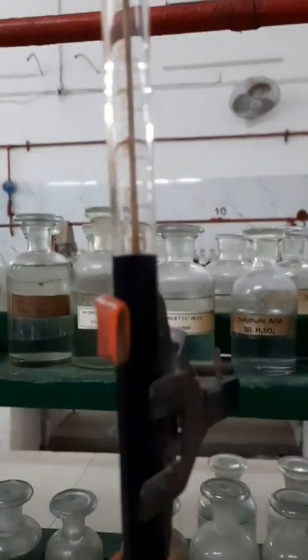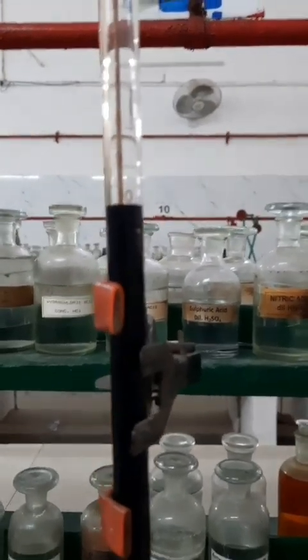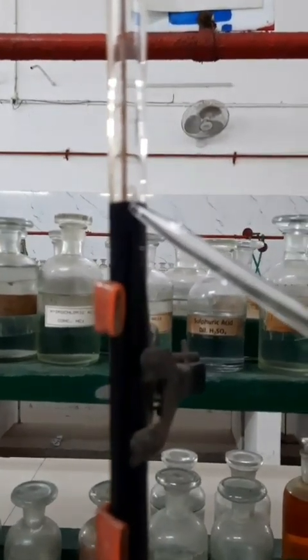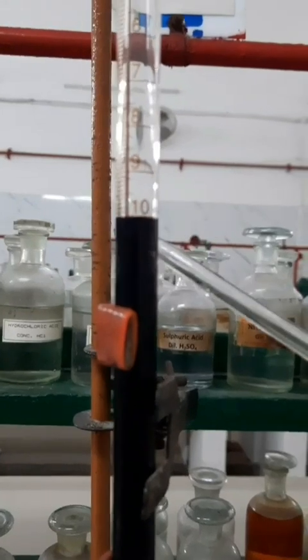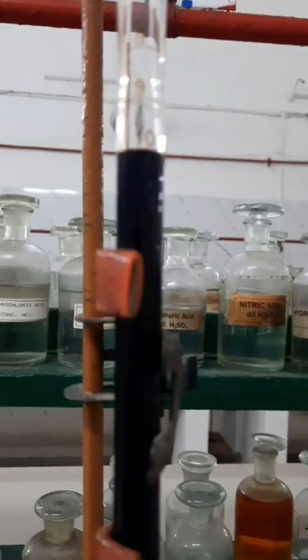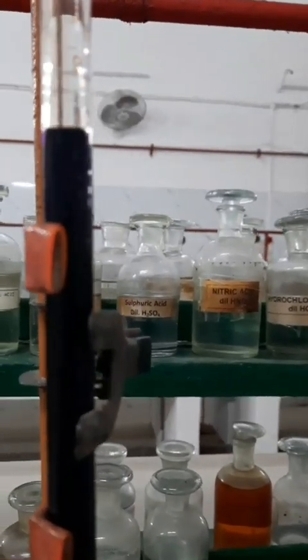As you can see, the upper meniscus of the solution coincides with the mark indicated as 10 ml on the burette. Record this final reading of the burette. Now note it down in the observation table. Initial burette reading was 0 ml and the final burette reading is exactly 10 ml. So we get that the end point lies near about 10 ml.